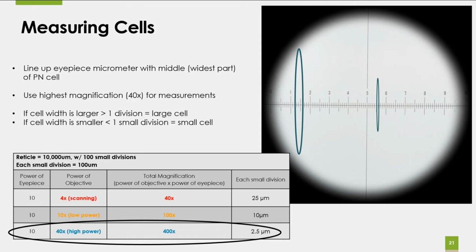I rewrote the SOP pretty much completely because the original one Eric had brought in, and a lot of it was accurate in terms of the field collection, but our analysis has changed so much over the years, especially because we've seen blooms in the past couple of years that we had never seen, because we hadn't had a program and also because we just hadn't had blooms in the past. So we had to adjust a lot. I think it was 2020 that we made a lot of changes because we were seeing things that we weren't equipped to really handle. But now we are hopefully equipped to handle them.